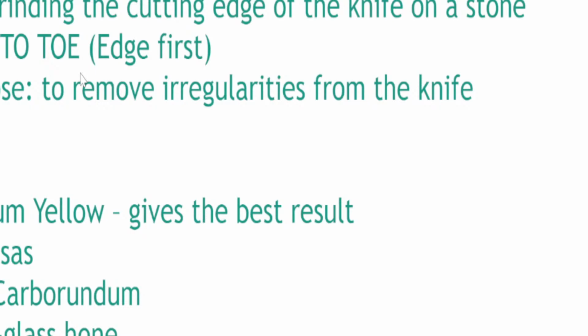I'll forward a video of how a samurai sword is sharpened, and you'll hear the words honing and stroping a lot also. Okay, so basically you have three types of hones. Ano yung hones? Yan yung hasaan. Okay? Yun yung hasaan class. So Belgium yellow gives the best results. Basically a type of stone that's yellow.